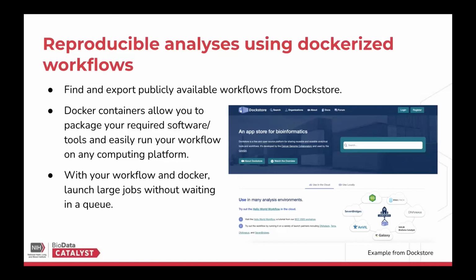So essentially, from Dockstore, you can export workflows and tools to your workspace or your project and run them in batches on several samples at once or whatever data type you're working with. But maybe you don't need to run workflows and you just want to visualize your data quickly, compute statistics, or use another interactive app. This is known as interactive analysis and is another key feature of the analysis platforms' workspaces.